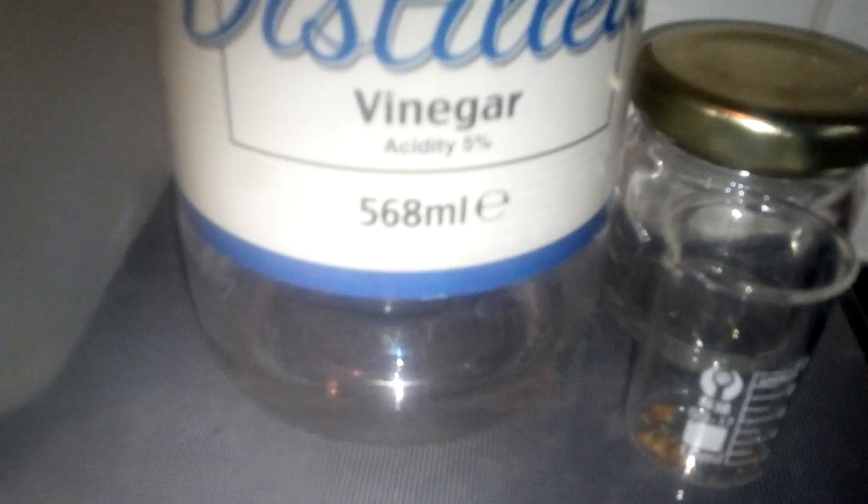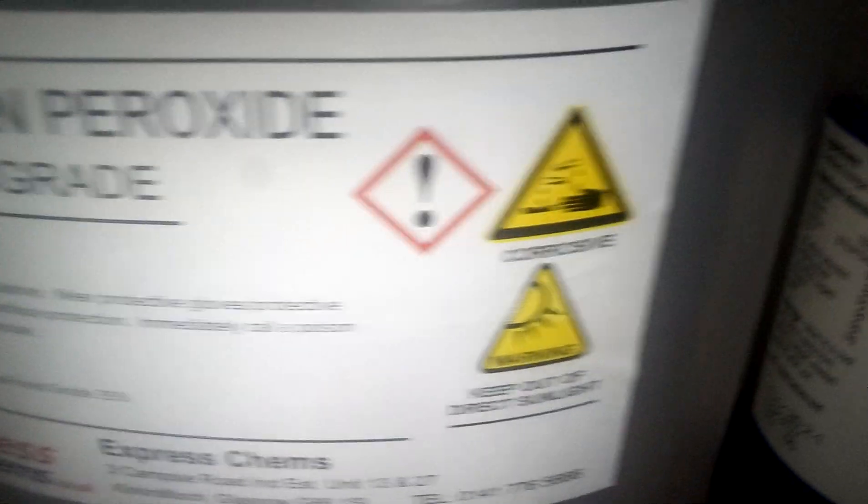So the gold that has been recovered is from these boards. It's an effective recovery method, considering it's only using cheap acid made from these ingredients. It's just a 50-50 mix of both, in order to recover gold at home.